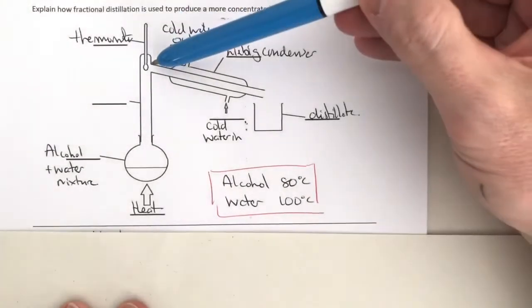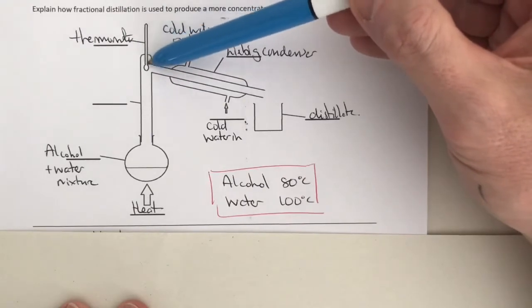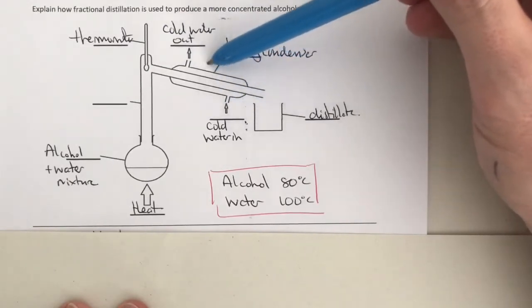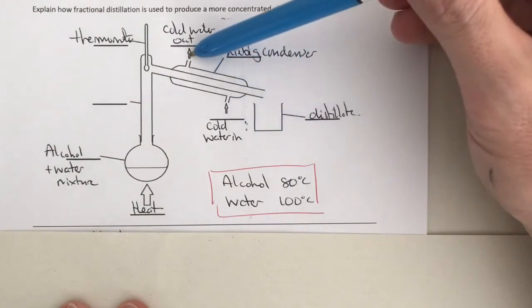Key points here: we've got a thermometer that's going to measure the temperature for us. That's going to allow us to know when it's at the right temperature and when we are collecting the alcohol that we need. We've then got this Liebig condenser. This is a cold water jacket. It completely surrounds this tube. We've got cold water coming in and cold water coming out.